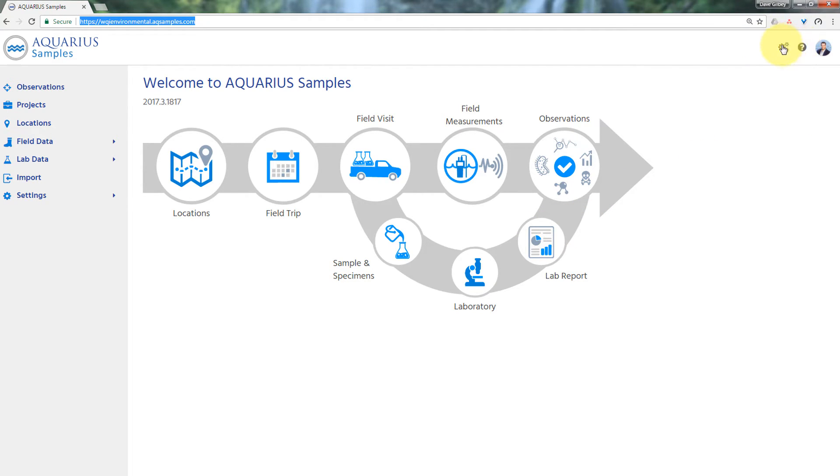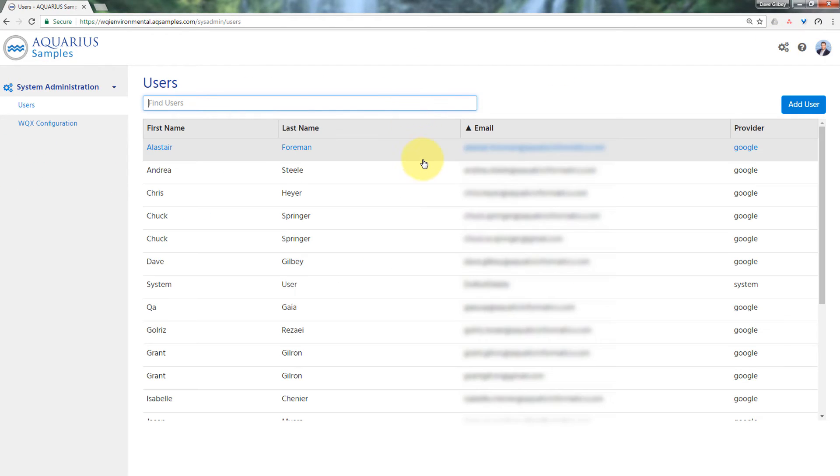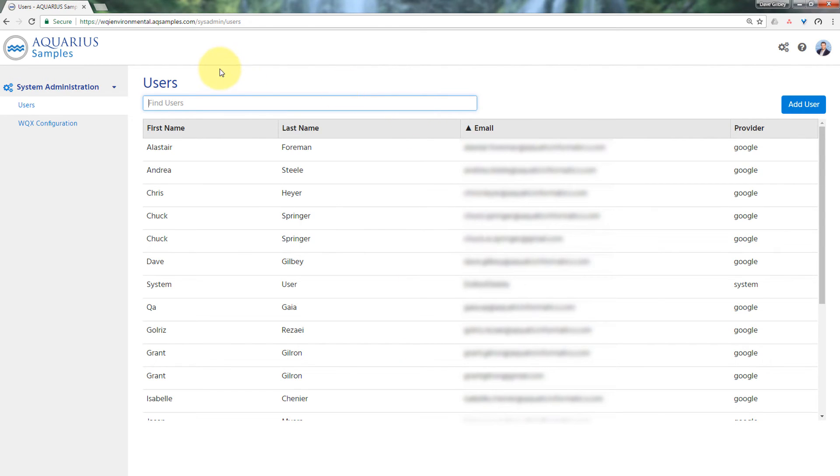This is an administrator icon here that takes you to the names of the named users in your Aquarius Samples account.